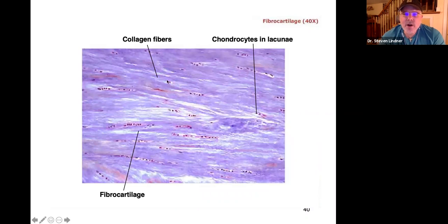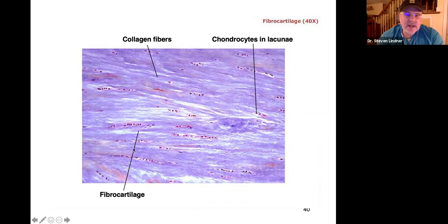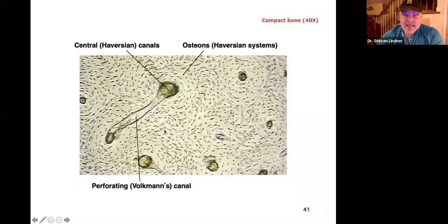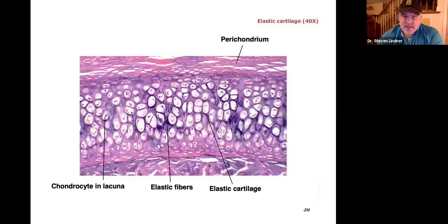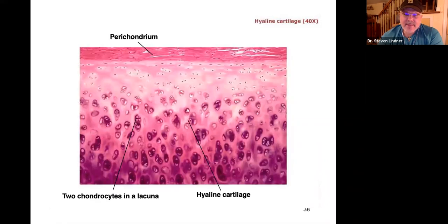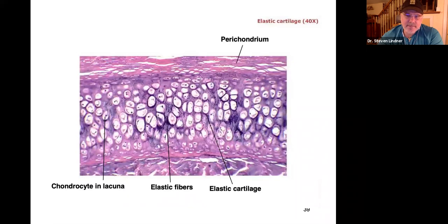This is fibrocartilage — your strongest cartilage. The intervertebral discs and the pubic symphysis are made of fibrocartilage. This is elastic cartilage, found around the nose, ear, eustachian tube, and lungs. And this is hyaline cartilage — your articular cartilage near freely movable joints.